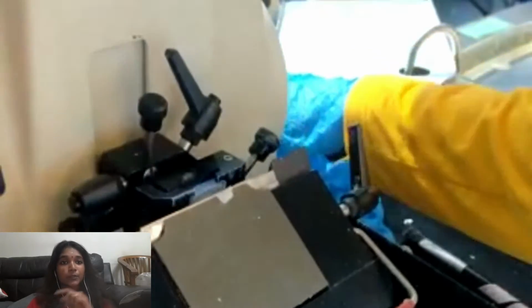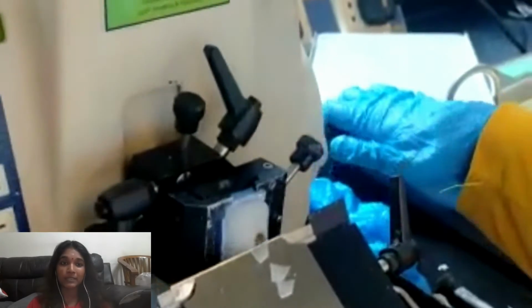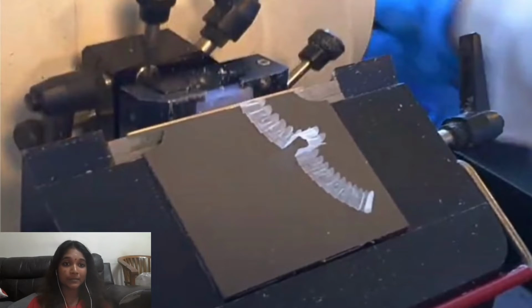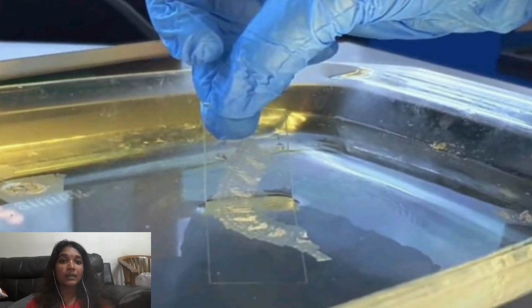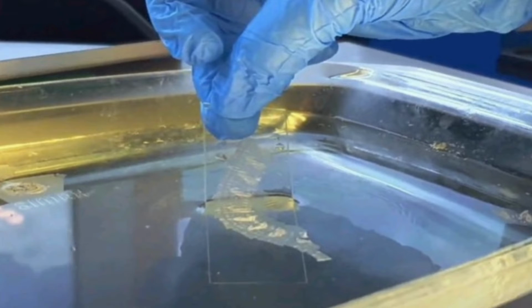The section thickness is set to 20 micrometer, and then it is trimmed until the desired specimen plane is reached. After that, the section thickness is set to 5 micrometer, and then it is sectioned, and once the ribbon formation is received, forceps and a paintbrush are used to pick it up and place it on the flotation water bath. Then it is fished using a microscopic slide at a 60 degree angle, mounted onto the microscopic slide, and left on the slide warmer to be dried for staining.